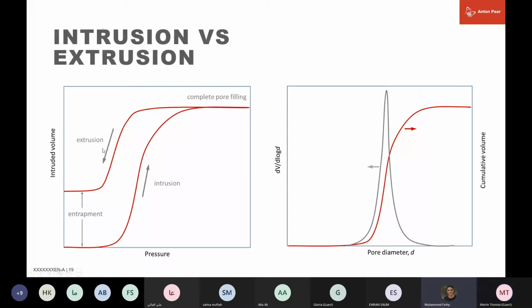The biggest indicator of pore network and ink bottle behavior, narrow necks, wide bodies, is this entrapment phenomenon. So not all the mercury that was pushed into the sample spontaneously leaves. So there will always be some mercury left behind in the pore structure. And this is, again, a characteristic then of the network. So it's sort of empirical. It's quantitative in terms of the amount of volume, but in terms of what the pore structure exactly is, it's more empirical, qualitative indication. But again, it's important information.